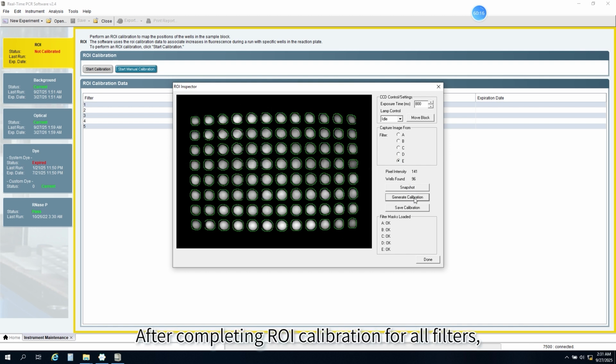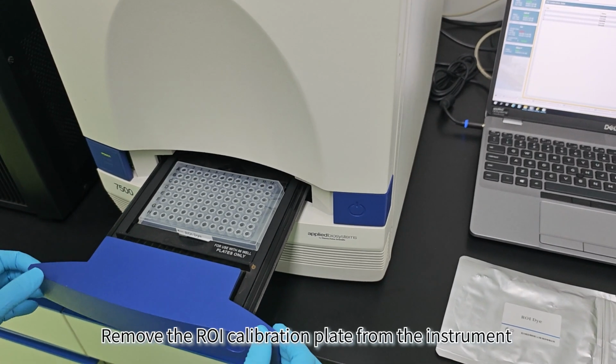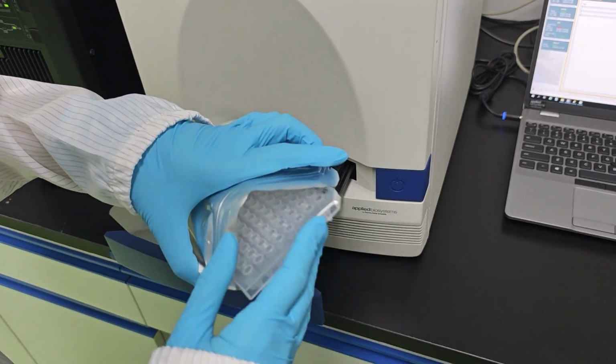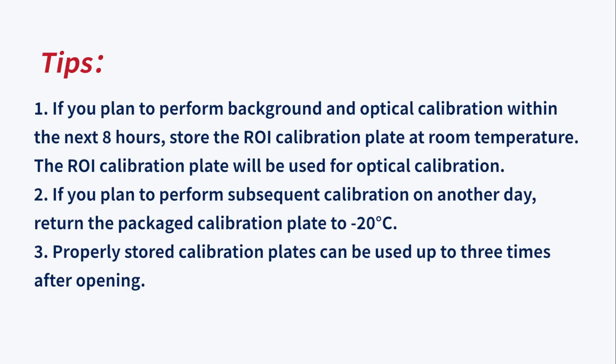After completing ROI calibration for all filters, click Done to complete the calibration. Remove the ROI calibration plate from the instrument and return it to its packaging. Tips: if you plan to perform background and optical calibration within the next 8 hours, store the ROI calibration plate at room temperature. The ROI calibration plate will be used for optical calibration. If you plan to perform subsequent calibration on another day, return the packaged calibration plate to -20 degrees Celsius. Properly stored calibration plates can be used up to 3 times after opening.